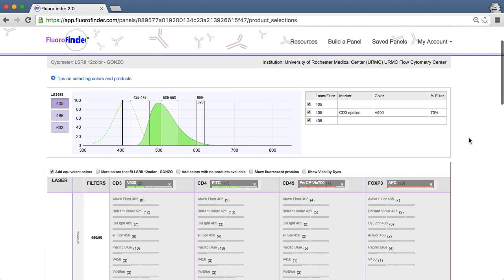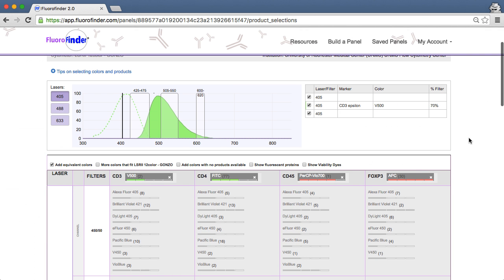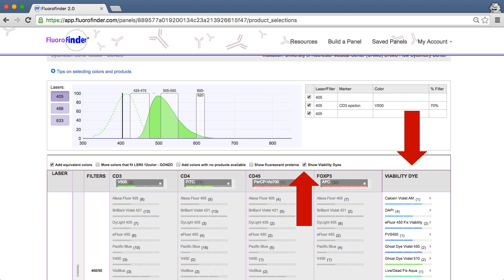If you happen to forget to add your viability dye in step 2, don't worry. You have the option of adding it by selecting the Show Viability box here.